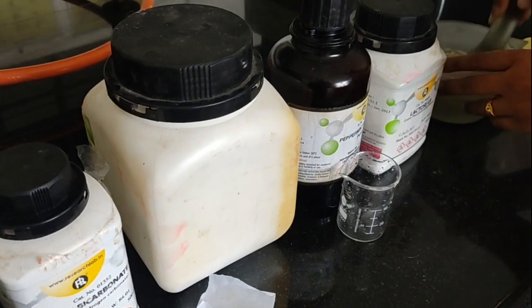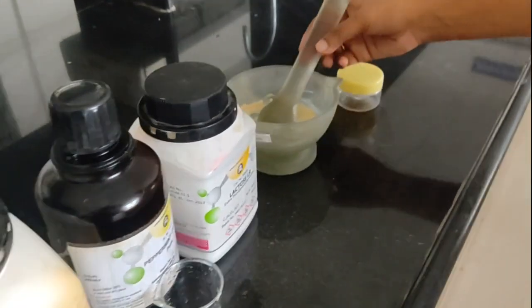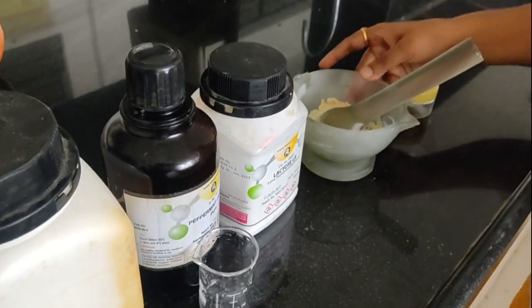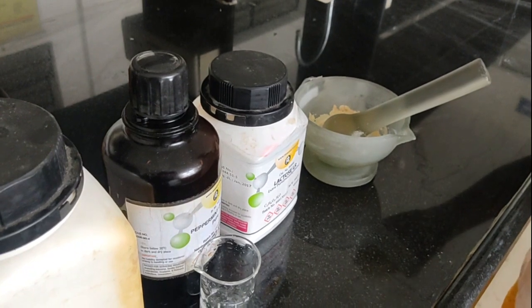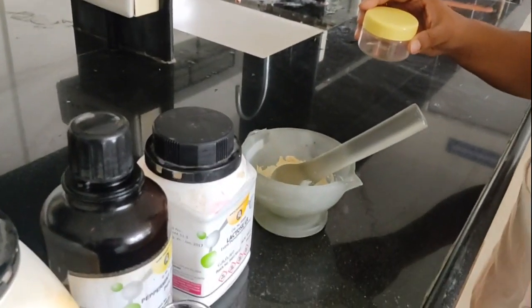Now, after proper mixing of all these powders, we will transfer it onto the white paper for double wrapping of each single packet of powder, and then we will store all the packets in this wide mouth container, and then we will proceed to the labeling part.